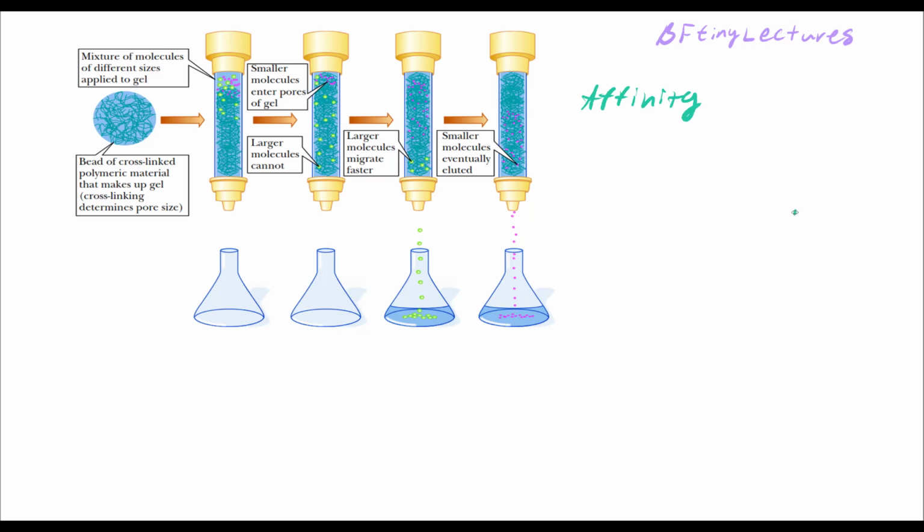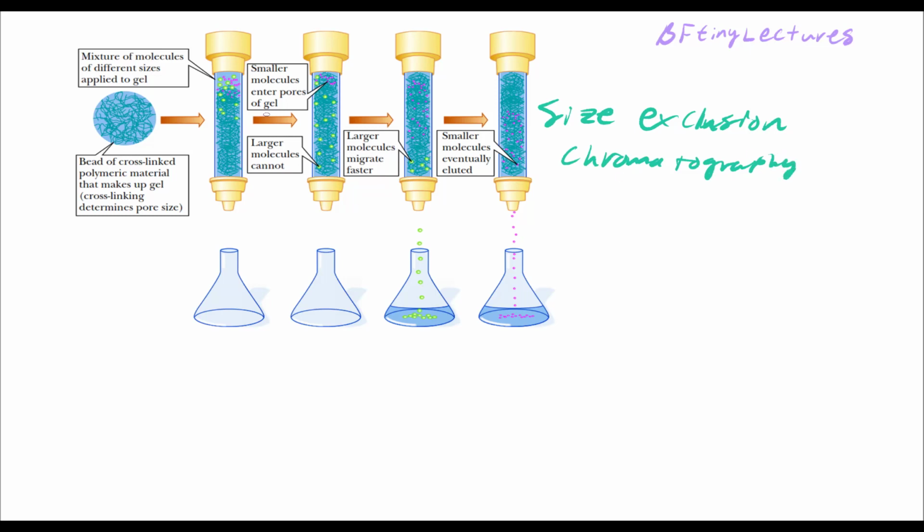Actually, this is not affinity chromatography. This is actually size exclusion chromatography, which is cool. So this is size exclusion. Exclusion, so that's a U and an L. Chromatography. And essentially, you want to get the sample.